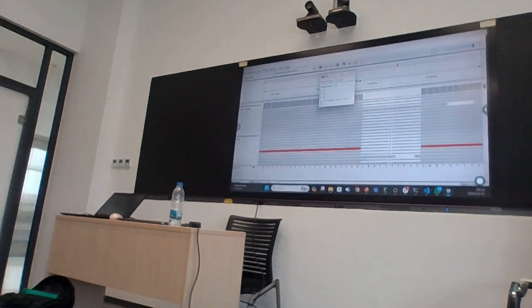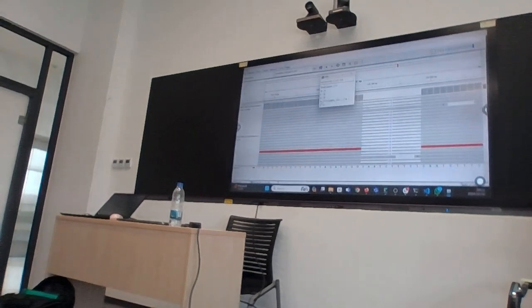How do you differentiate between a true deletion and an inability for us to sequence? Inability to sequence, yeah. That's a good point. Because the other thing is, could it be a deletion? Or could it be that the sequence doesn't map here? Okay, that's a damn good question because I didn't even think about it.